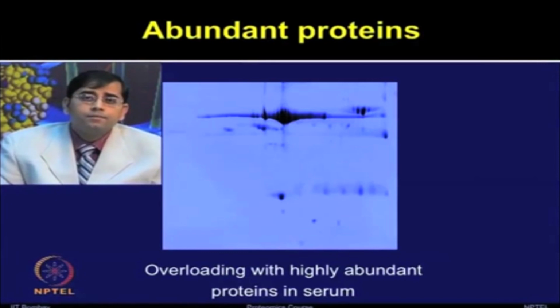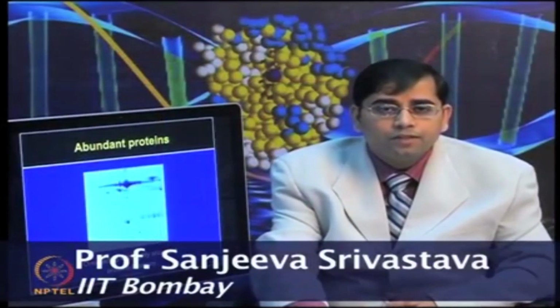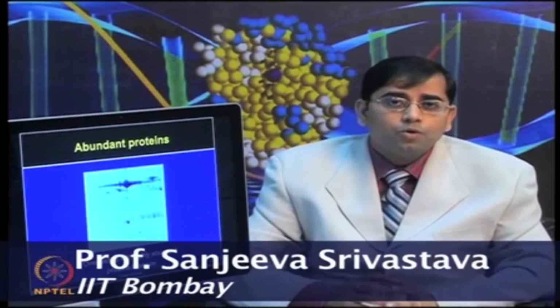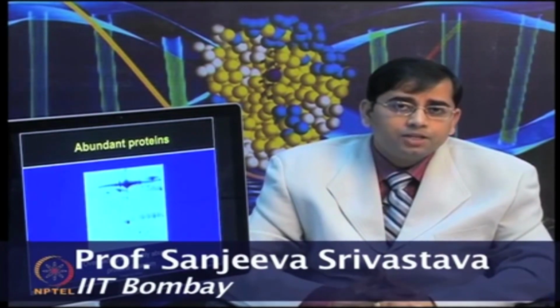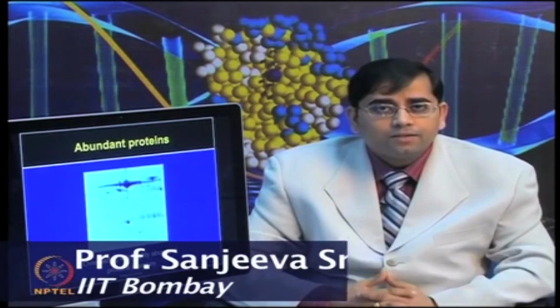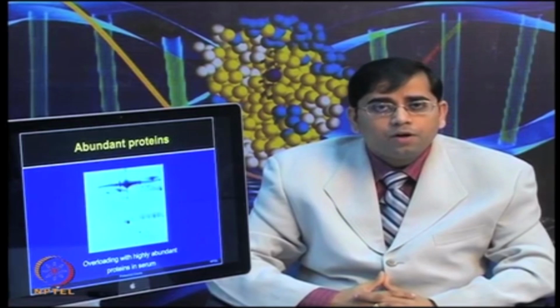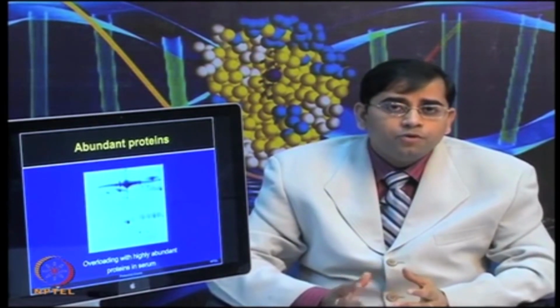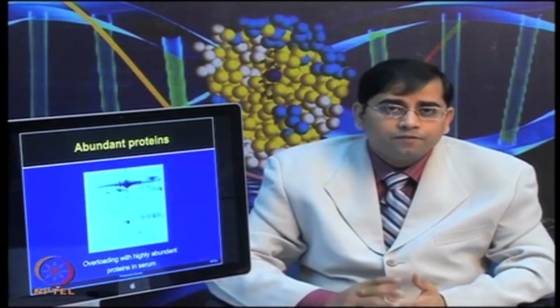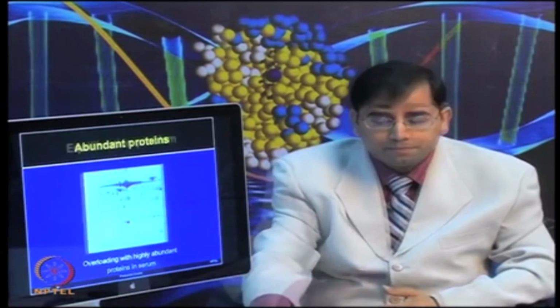In this gel, it is shown that human serum contains highly abundant proteins, which are visible in this area. Now, there are various ways one can overcome these limitations, and in the previous class on protein extraction and sample preparation, we talked about how to remove the highly abundant proteins. So, please refer to that lecture and one can overcome this limitation.